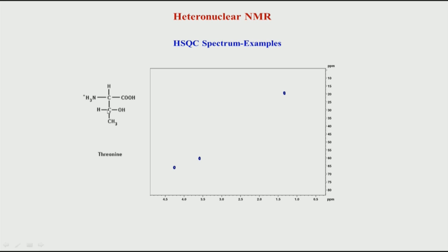And this carbon, this is here the beta. So, this is alpha, beta, gamma. So, the beta carbon is directly attached to an oxygen. Therefore, we expect a downfield shift because of that, and this beta carbon comes way down here where I am pointing the arrow at around 65 to 70 ppm, and also the alpha proton is downfield shifted, and alpha is here and beta is here.